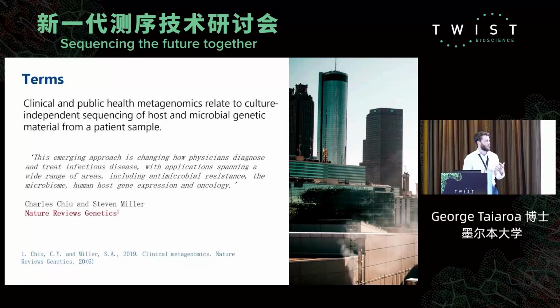So this is a really nice intro slide as to why we need to use culture-independent methods for sequencing. If you go back over maybe 2 or 3 decades, everything in public health microbiology was based on growing up bacteria or viruses to then have enough material to sequence them and say what's happening in their genomes or what's happening in their biology.